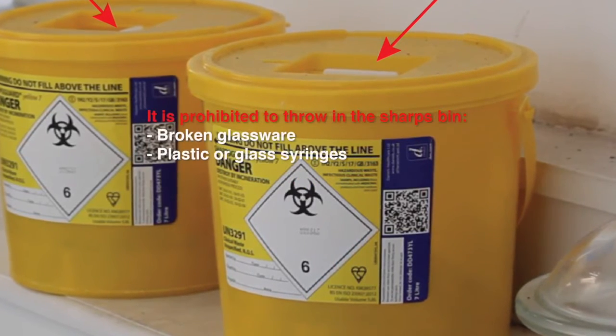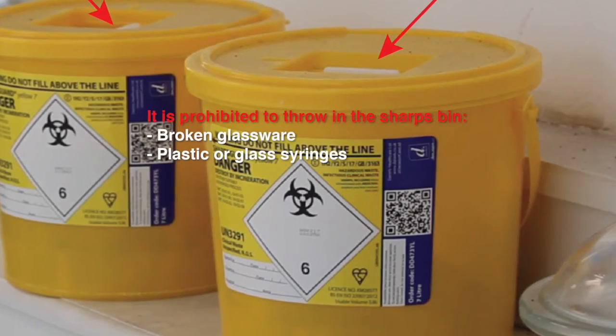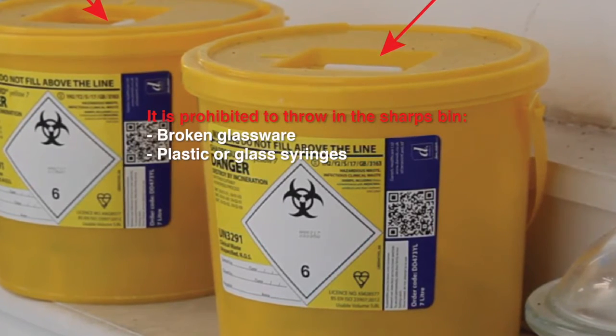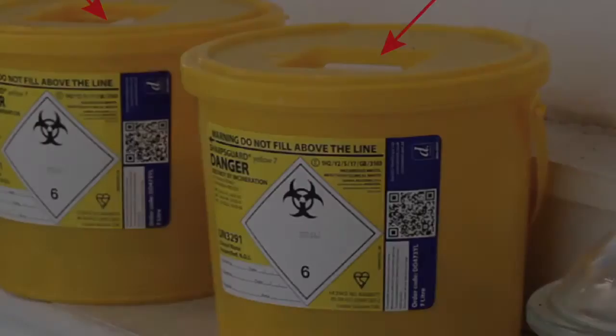It is prohibited to throw in the sharps bins broken glassware, plastic or glass syringes. These need to be emptied and thrown in the designated waste bins.